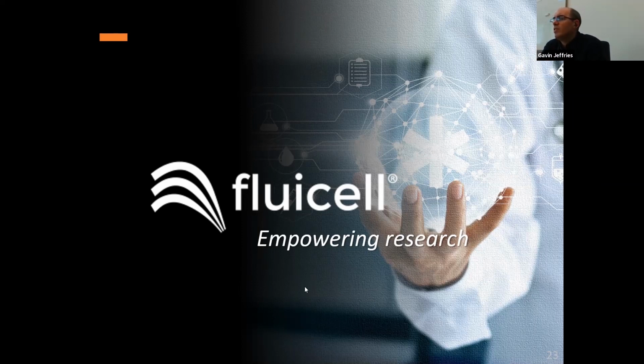The other caveat would be that it is hydrodynamically confined, so we need to have it submersed in a medium. We can't do this in air. This is in the same way that we print typically in culture media. Culture media is what's on the substrate. It's also what the cells are housed in. So we need to have this all-liquid environment for actually doing the printing.